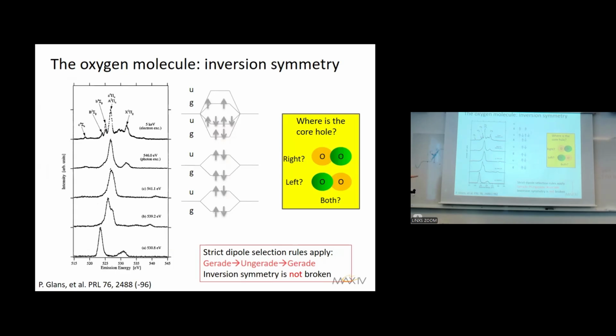So what we did, we measured a series. This is measured on the first excitation, which goes up there, and then you have the gerade going down, as expected. You only see a single one. At the top, you see all of them because this is electron excited. You have no selection rules. So there you see all of these different levels represented in your spectrum. So clearly that's this one that we see.